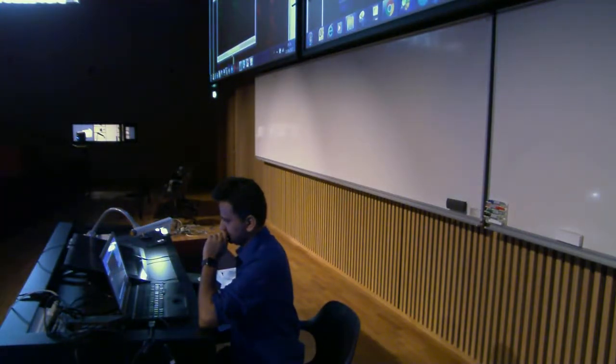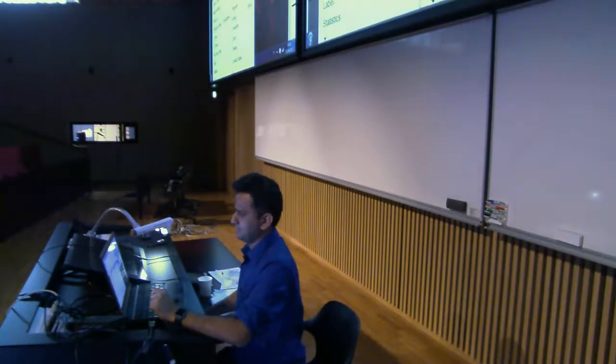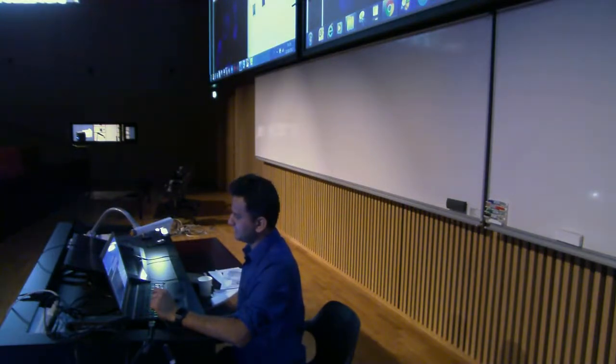Yeah. Slice. I really don't know, man. Okay, we will cover this later because I have to figure out why it's not doing that.